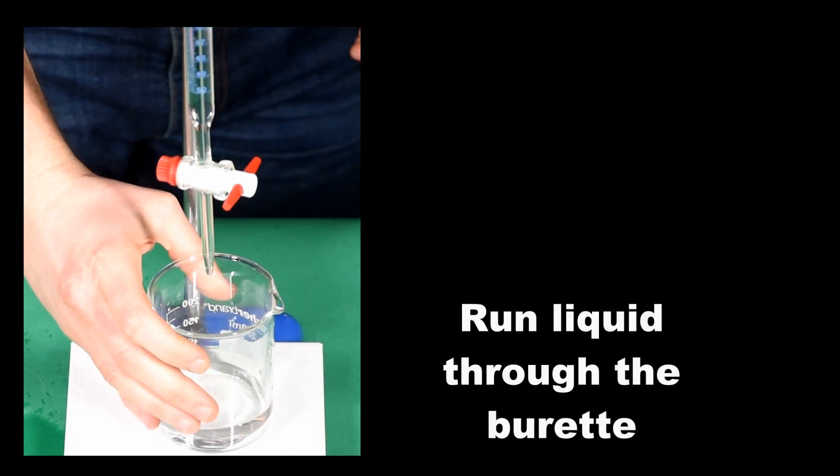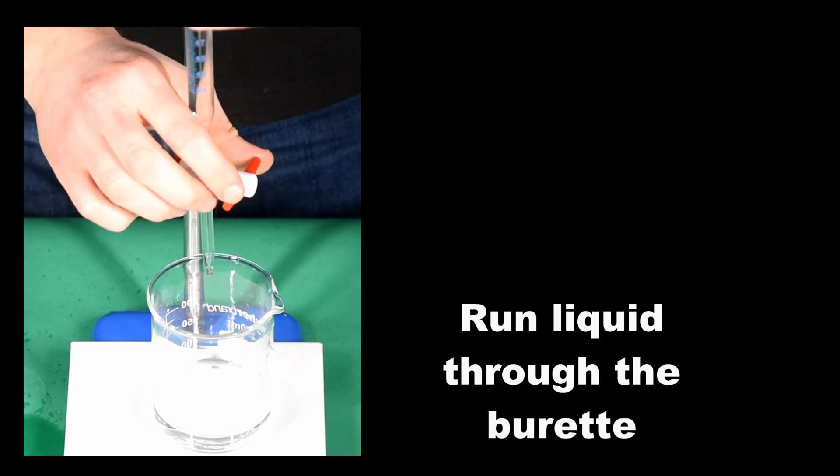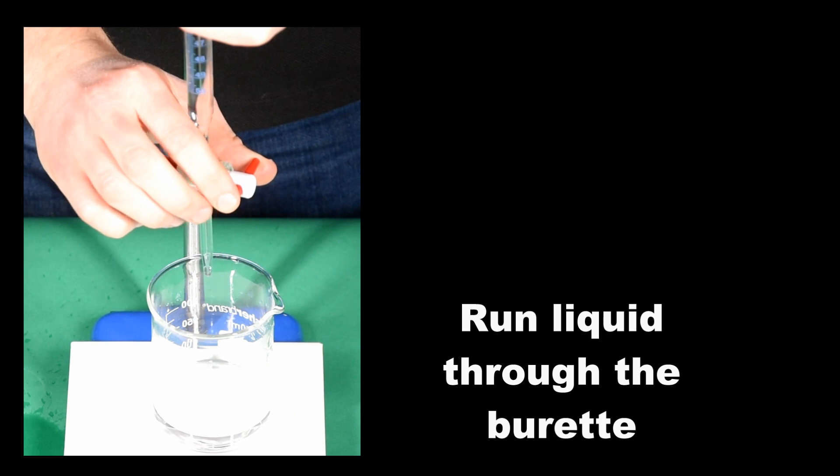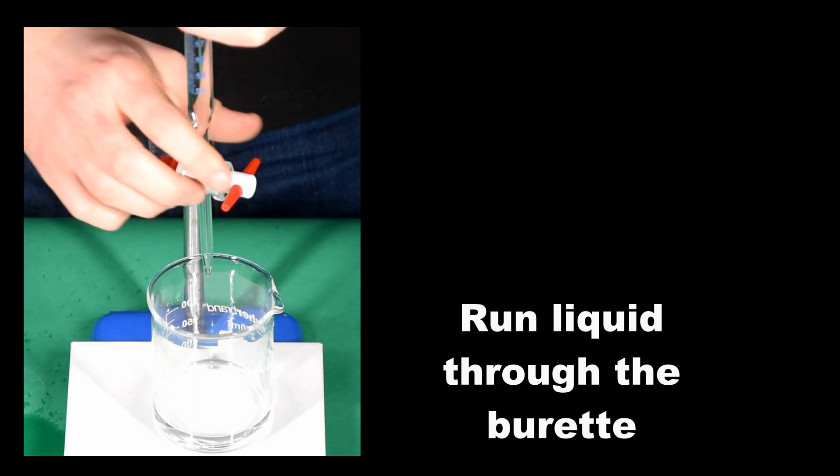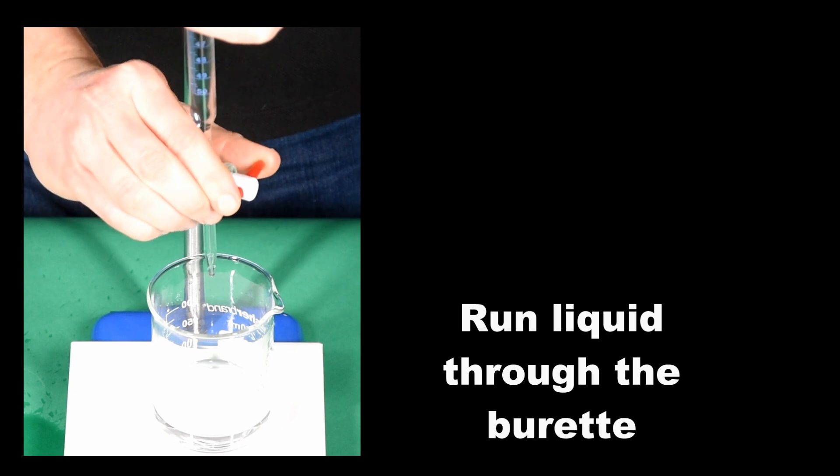Run some liquid through the burette to get rid of any air that may be below the tap. You should now note the level of liquid on the burette's scale. It does not need to start at zero, though this might be slightly more convenient. Discard the runoff acid.